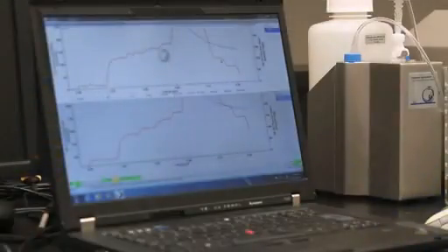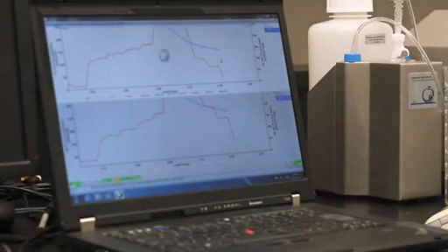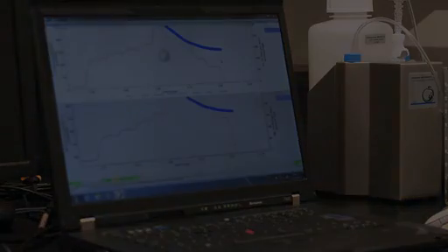The electrodes send a voltage signal to the computer, which is directly proportional to the concentration of oxygen. So, this measurement is seen onscreen as a blue line.